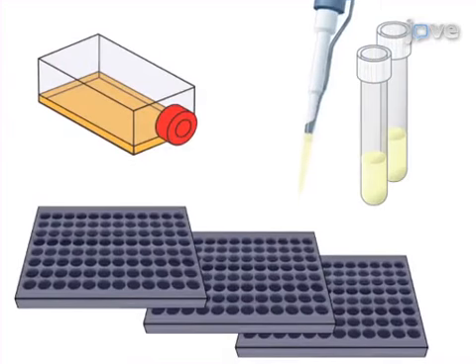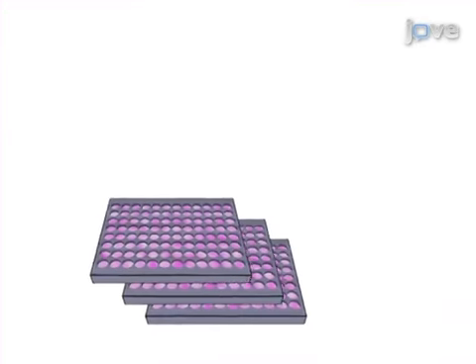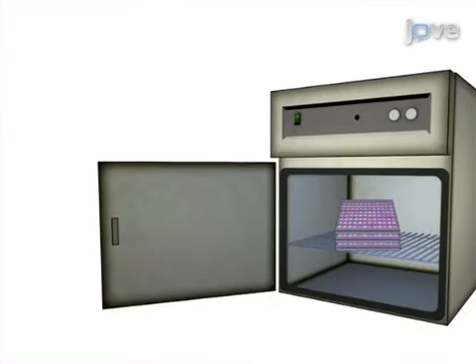This is achieved by adding wild-type or mutant Salmonella strains to macrophage cell cultures in 96 well plates for 30 minutes as an in vitro infection.